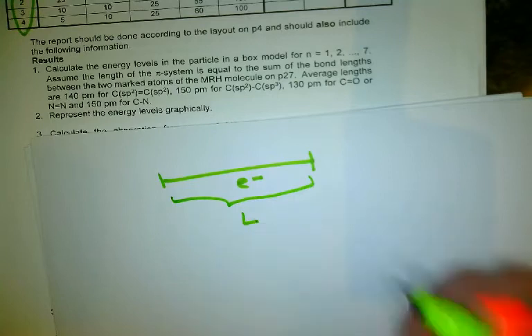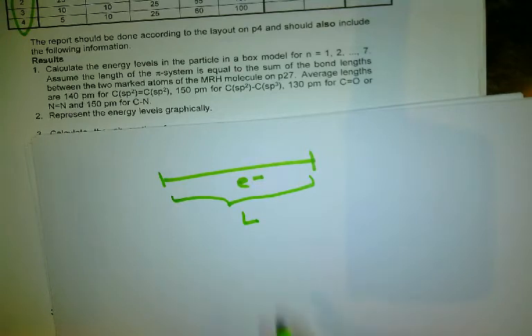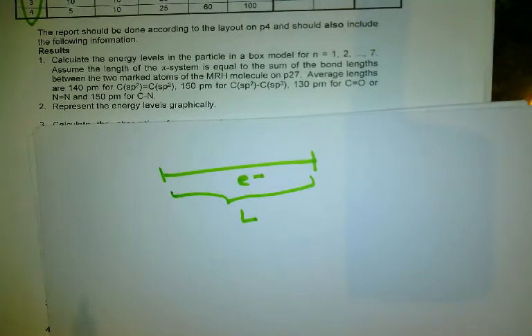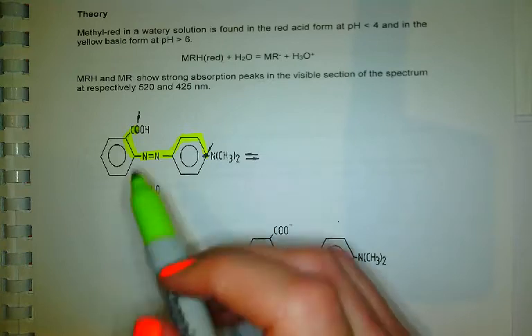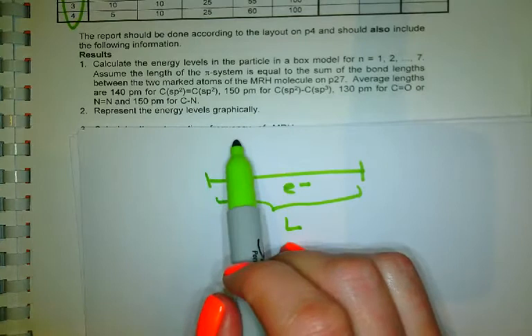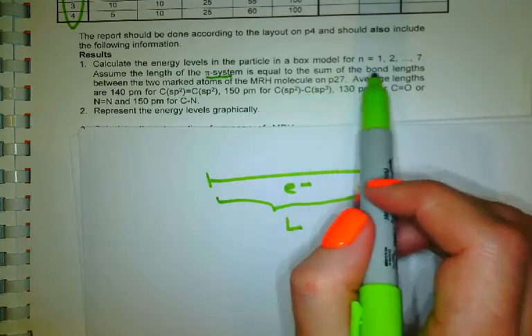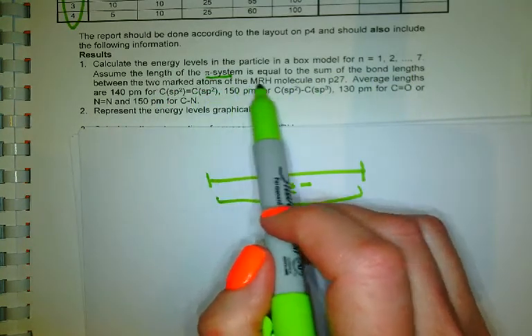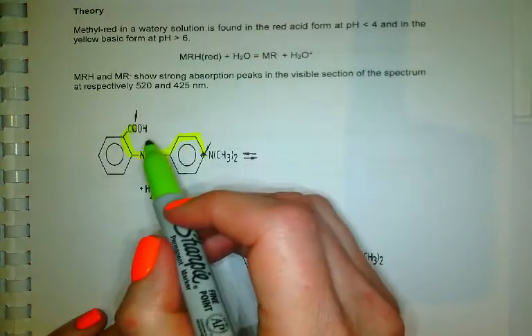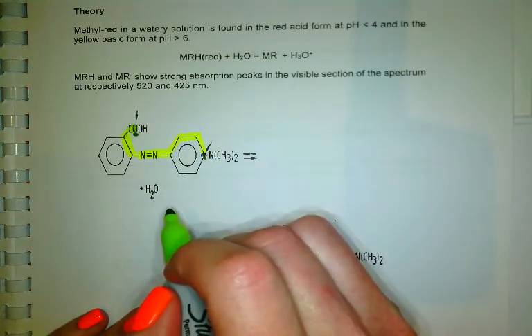So what we need is the length of this box, which we indicate with the symbol uppercase L. If you look at your practical manual, on the first page you are shown a drawing of the methyl red molecule, and it also tells you that you can calculate the length of the pi system as the sum of the bond lengths between the two marked atoms on this page.